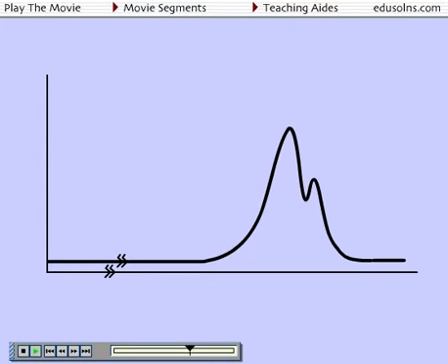Another important use of integration software packages is integrating shoulder peaks. This can be done in a variety of ways. First, the integration marks can be placed here and the complete area under the curve included in the integration. Another option would be to use the same tick marks, but estimate the baseline as the curve that the larger peak would assume if the shoulder peak were not present. A straight line could also be used. Note the difference in the shaded areas.